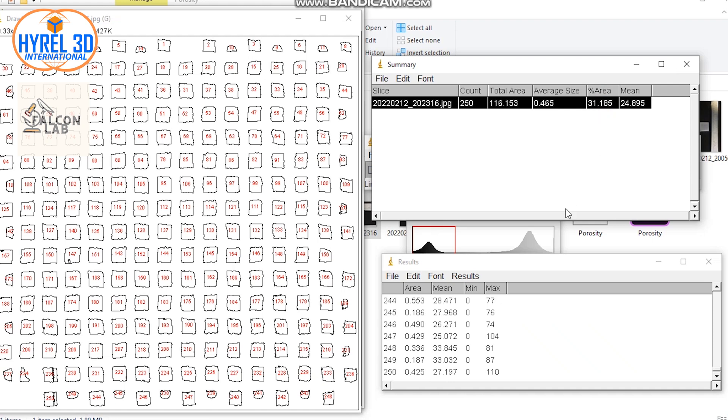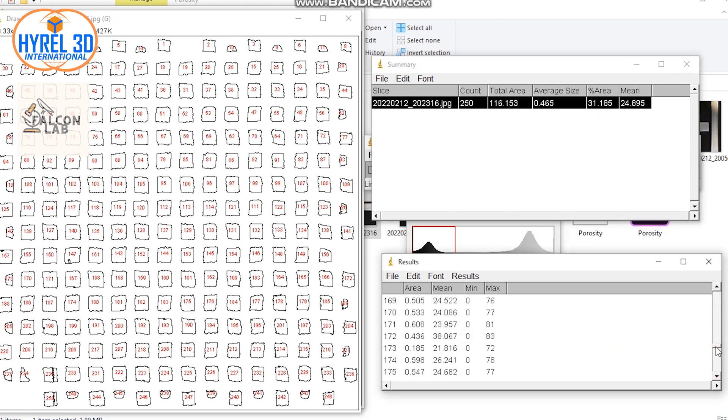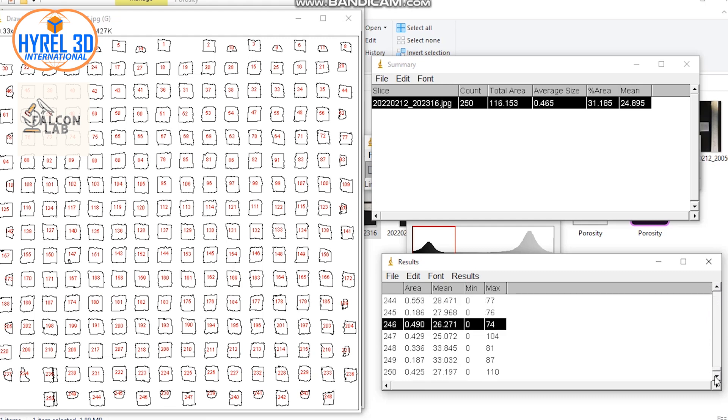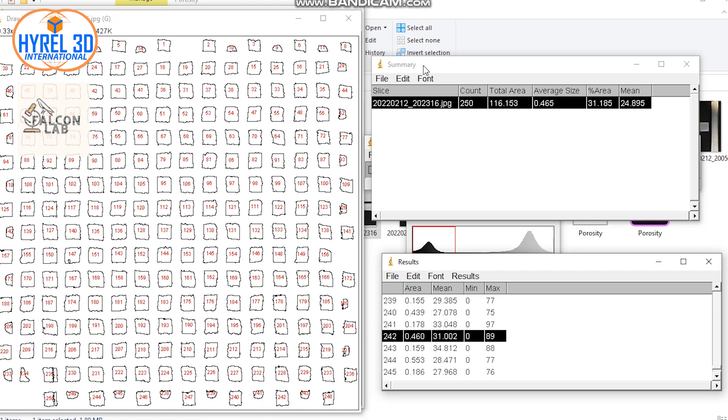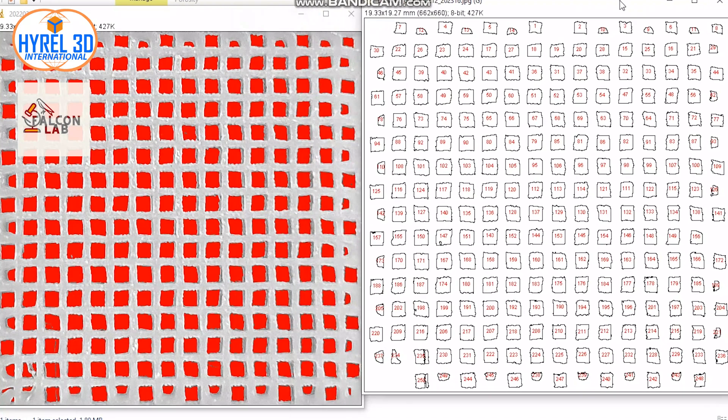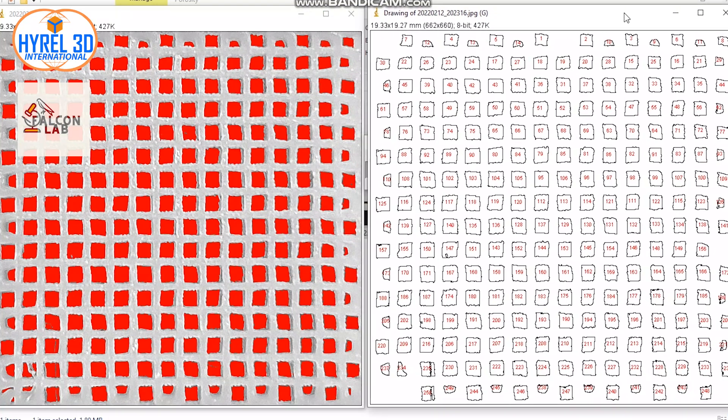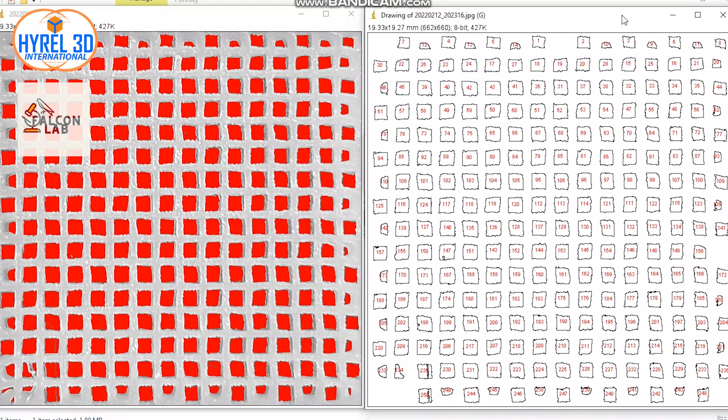The last window is to give you the full detailed information for each pore. Let's choose number 241 and locate it on the outline. You can compare it to 242 and see how different the size is.